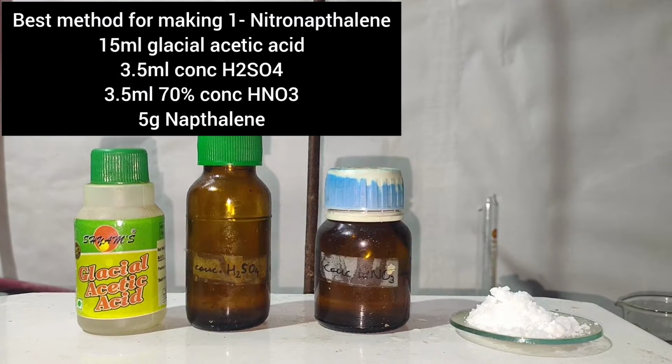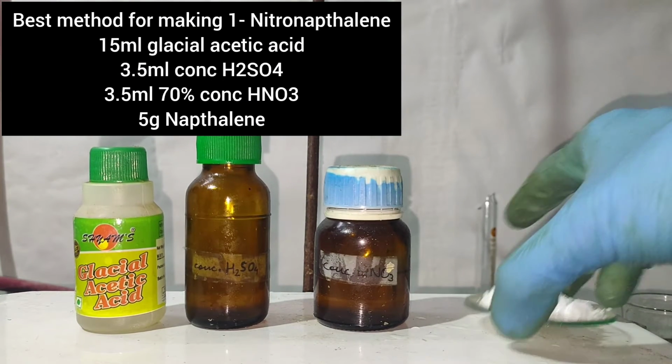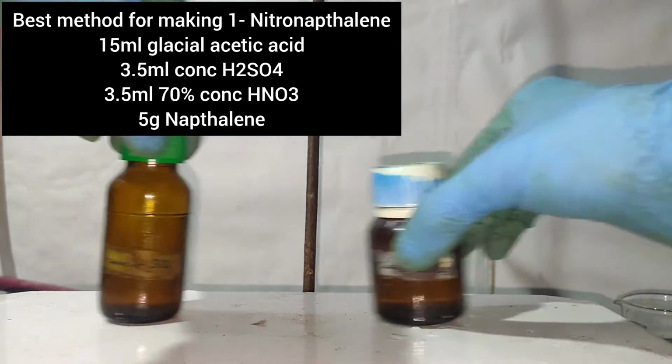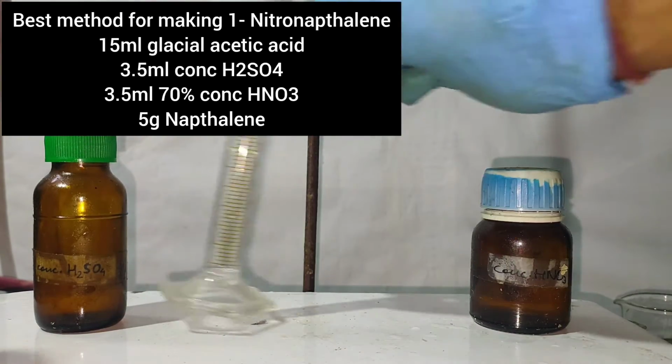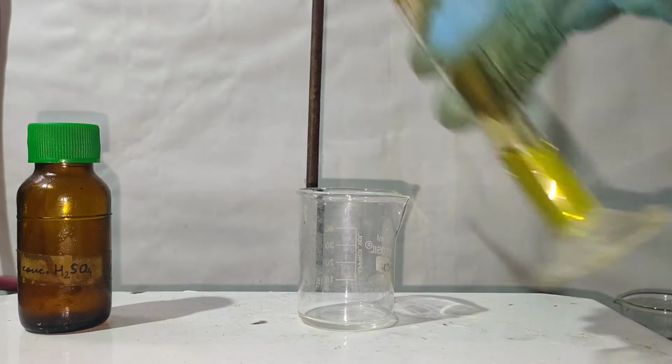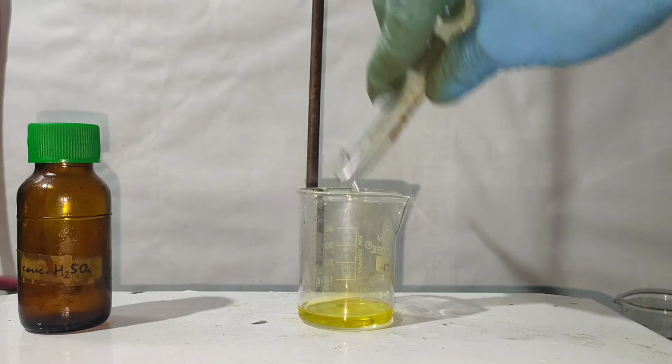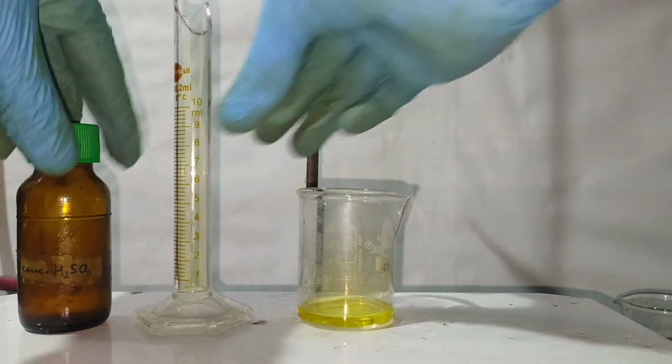Again I measured 5 grams of naphthalene, but this time I decided to use a solvent to provide uniform nitration, which was acetic acid. So first I prepared the nitrating mixture by taking 3.5 ml 70% nitric acid.